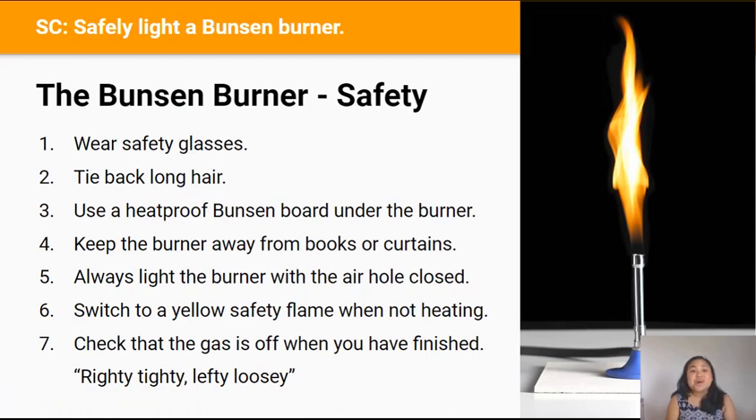Soon you'll be lighting your own Bunsen burner with your neighbours, but first we need to go through some safety rules. Rule one: wear safety glasses — you can get them from the red basket on shelf one. Rule two: tie any long hair back. If your hair can dangle over your face, that's long hair, and you risk burning it so you must tie it back.